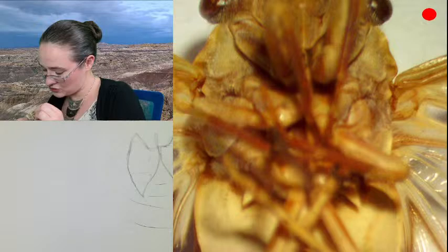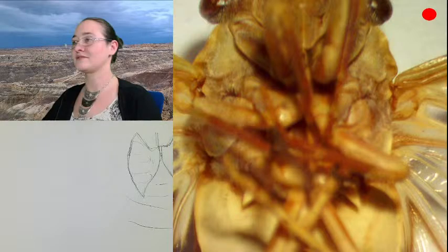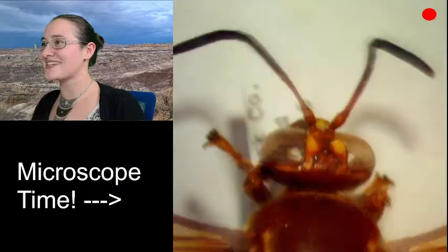Cicada killer! Deborah's in! All right. Very good. Let's get the cicada killer. Sweet. My cicada killer has two compound eyes and three ocelli, just like my cicada had.